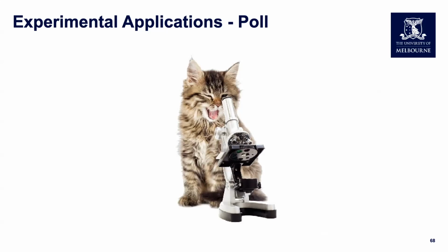For question 2, which technique is often used for imaging full organisms or intact tissues which are between 1 and 20 millimeters in size? In this case, ideally that would be the light sheet system for those larger samples. Certainly not STORM, which, as I say, is for very small samples at high resolution. Okay, I think most people got those correct.